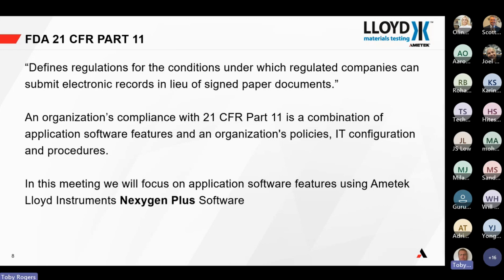One key point to make is that an organization's compliance with the regulation is a combination of the application software used on the laboratory instrument itself doing the measurement, but it also involves an organization's policies and its IT configuration and procedures. It's not the software alone that is compliant.